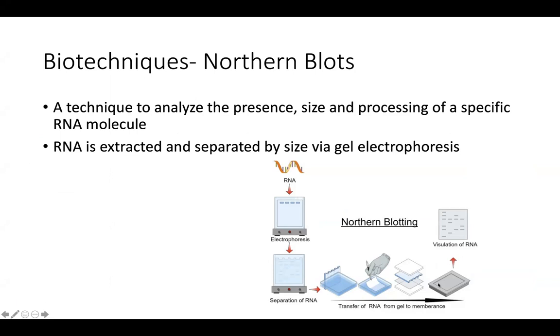RNA is extracted and separated by size using gel electrophoresis. So it's a very common technique that's utilized, and it has many different applications depending on the question that you are trying to answer, right? Again, we have the sample. We have to extract RNA exclusively, right?